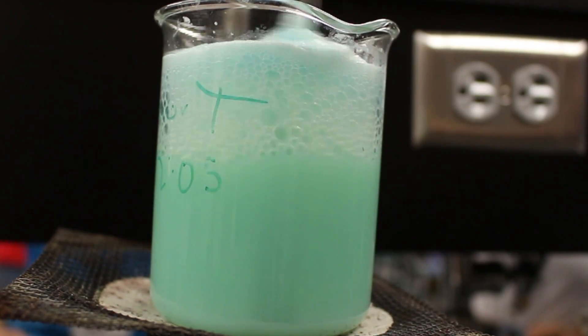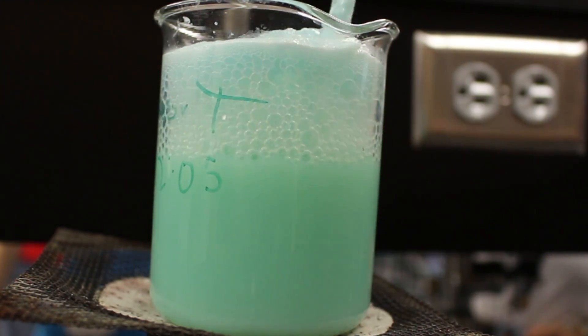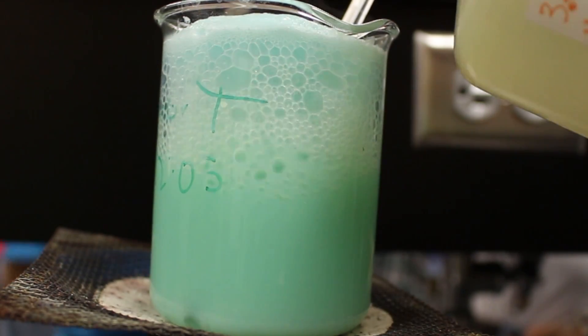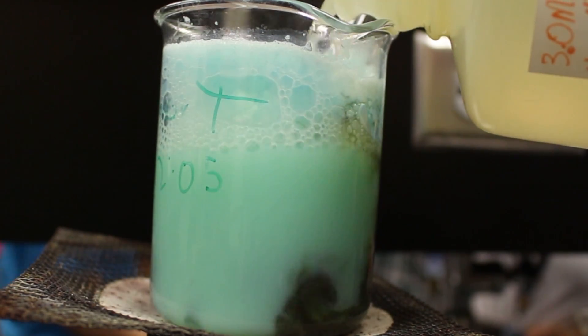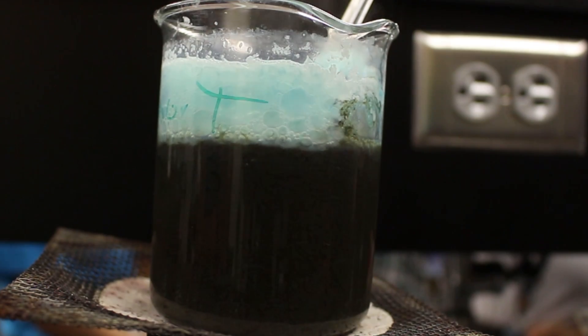After the heating of the copper 2 hydroxide almost to boiling and the addition of some extra sodium hydroxide, black copper oxide was formed.